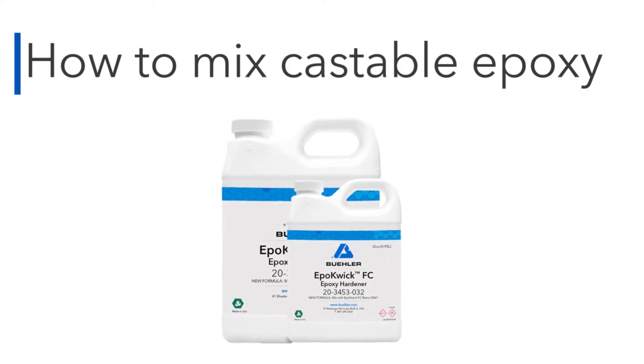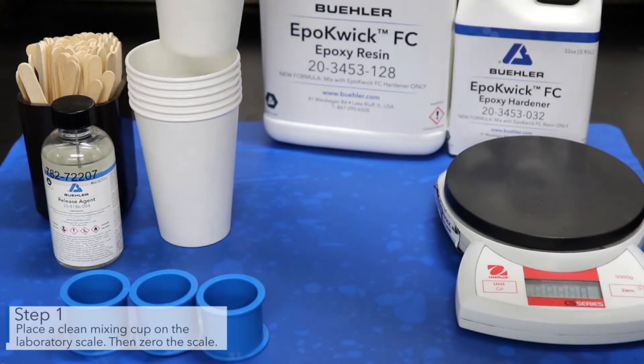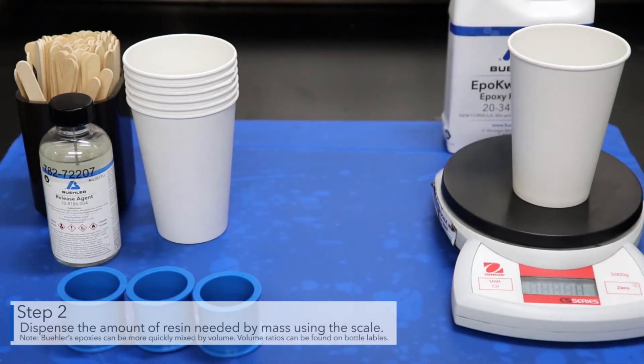Welcome to Buehler's how-to video on mixing castable epoxy systems. Place a clean mixing cup on the laboratory scale, then zero the scale. Dispense the amount of resin needed by mass using the scale.